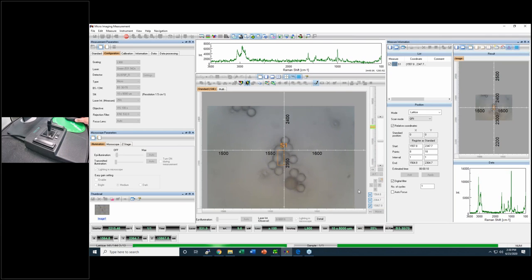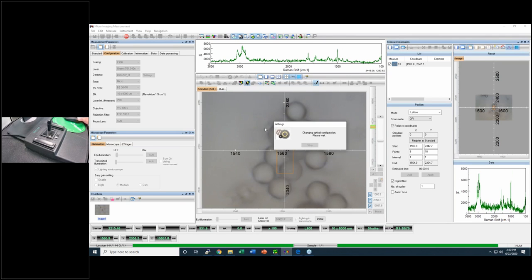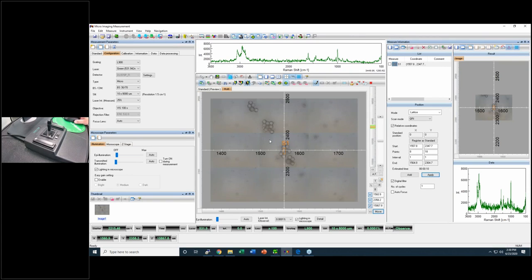So, of course, I chose a very small area for this demonstration. Of course, you can do this in a larger area, especially using the multi-image. In the multi-image, we can zoom in and create a larger area to do the measurement. This mode is designed for much larger areas than the one I chose now, and especially for measurements that can take hours. The measurement that I just did took 10 seconds from the moment it started.